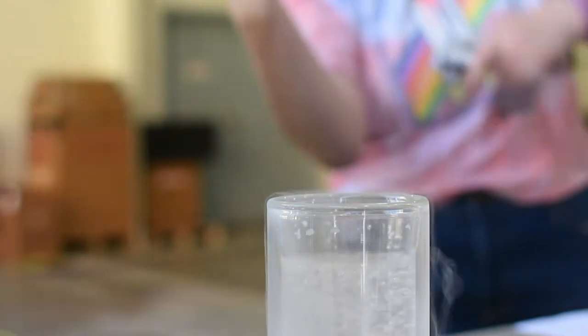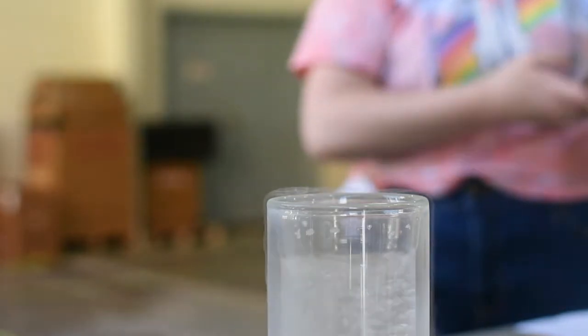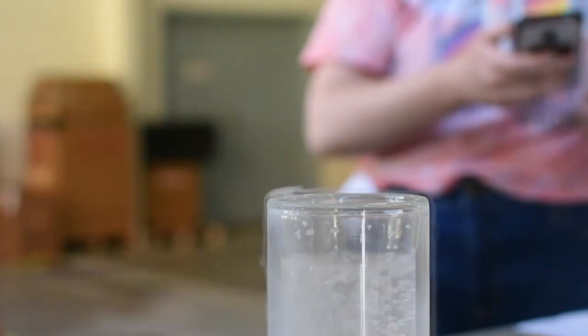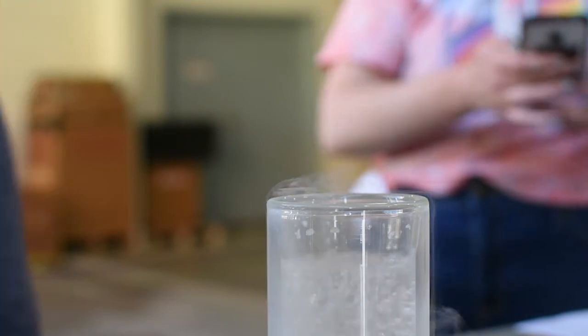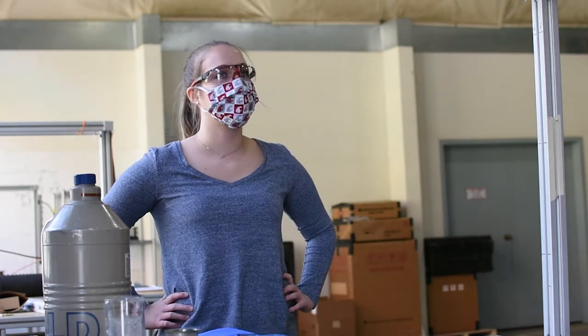If you guys have any questions or anything before we move on, now's the time. So besides hot pavement, what other areas do you want to avoid? Because the wooden table is combustible, the paper's combustible. So where is it okay and where is it not?